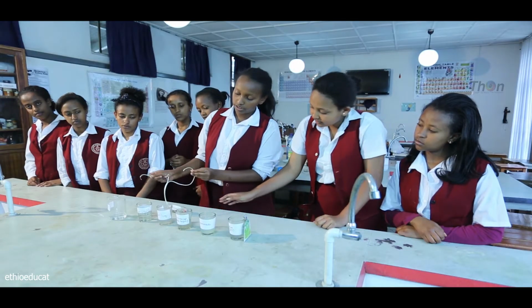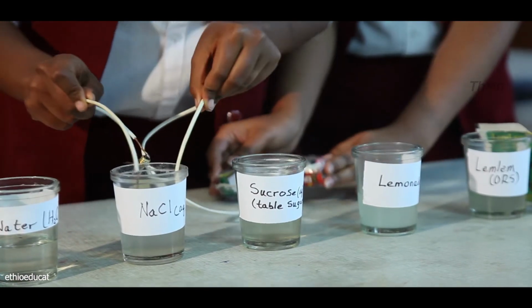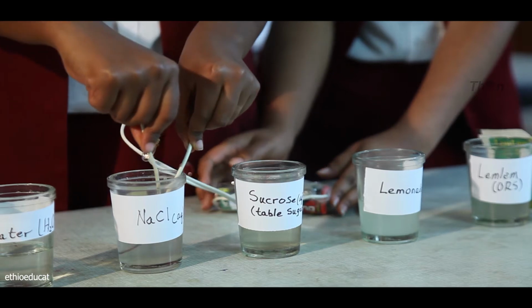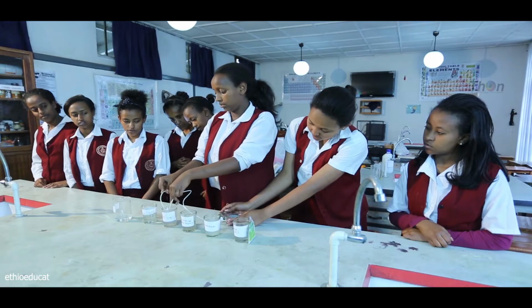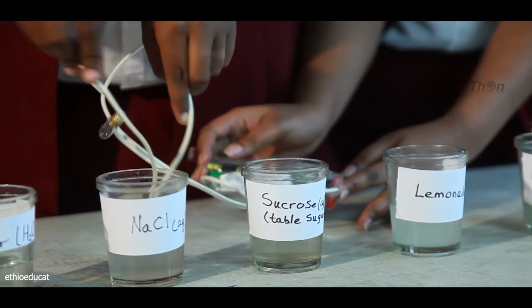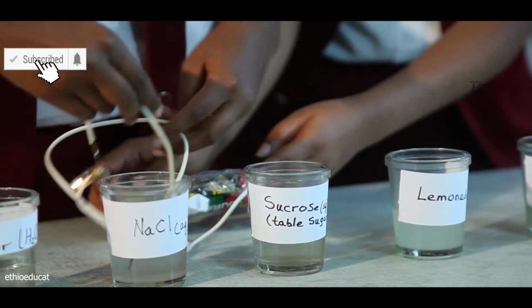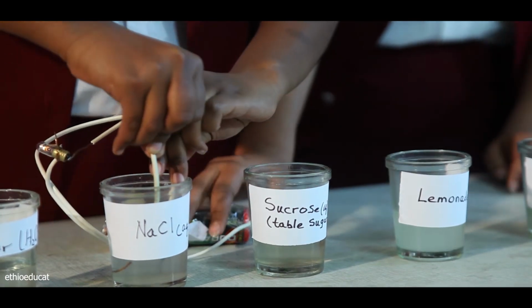Then now I'll insert it into my sodium chloride solution. Okay, are you seeing lights coming? Let's make it very clear. Let's switch the apparatus so that we can completely immerse the wires in the solution.